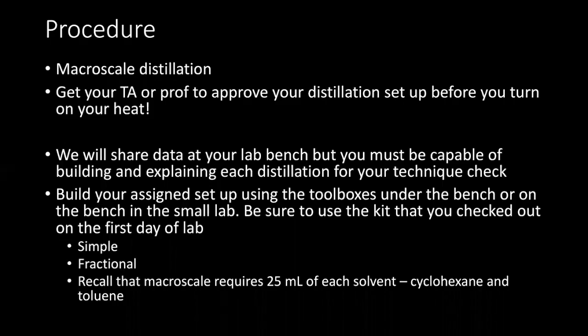I'm going to go over this week's procedure for the distillation lab. We will be using our macro scale distillation glassware, and be sure to get your TA or me to approve your distillation build prior to turning on your heat and actually heating your solution.